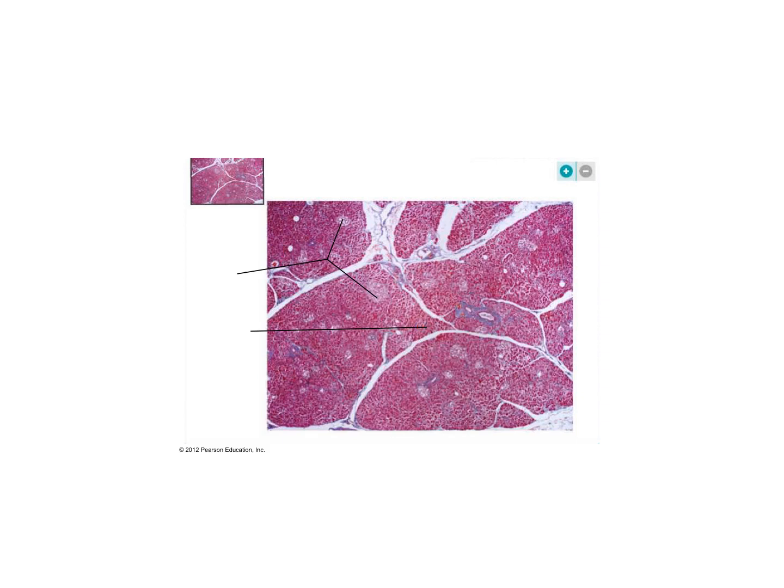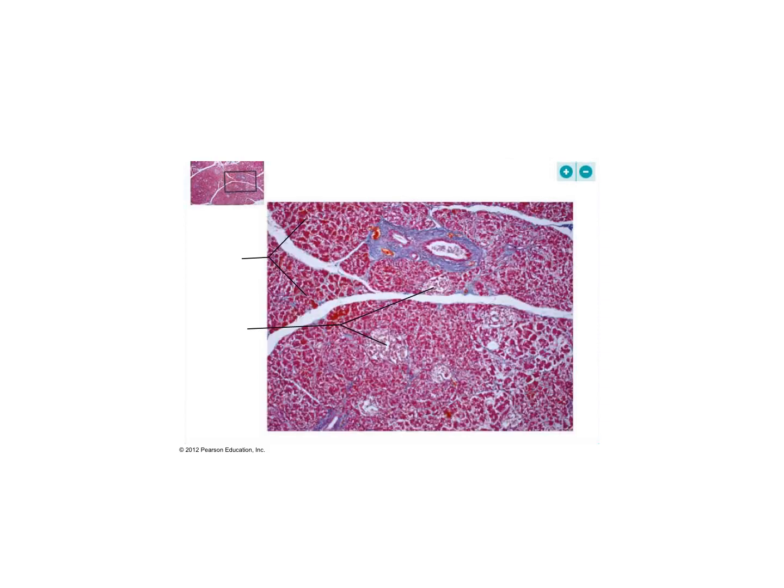And then let's look at the next slide. This is a closer picture of the pancreas. And again, we have this line going to the acinar cells, the cells that are producing digestive enzymes into a duct. And then we have this line going to these lighter colored islands of cells called the pancreatic islets.